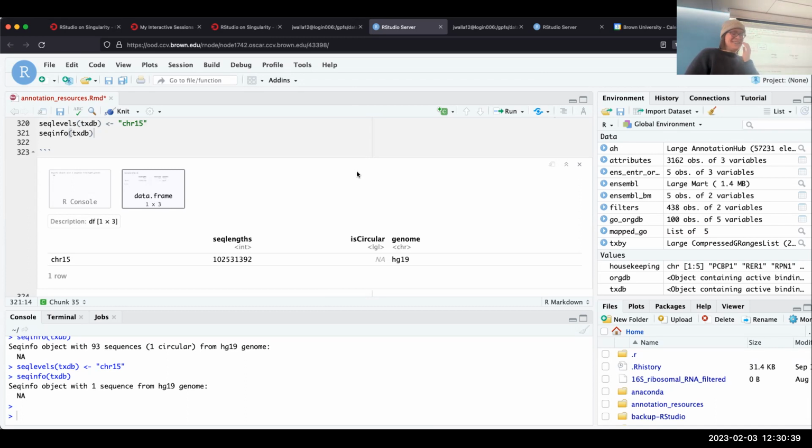No, you are. The follow-up question: with all these IDs, like Ensembl, Entrez, I'm curious if there is a primary key for all these IDs, or if there is none and they're all independent. I feel like you can't go wrong with just having the ranges of the object.